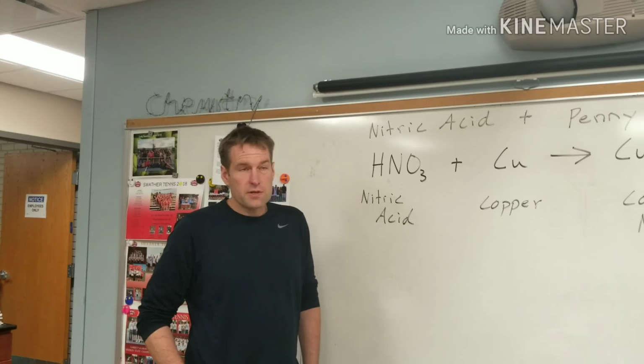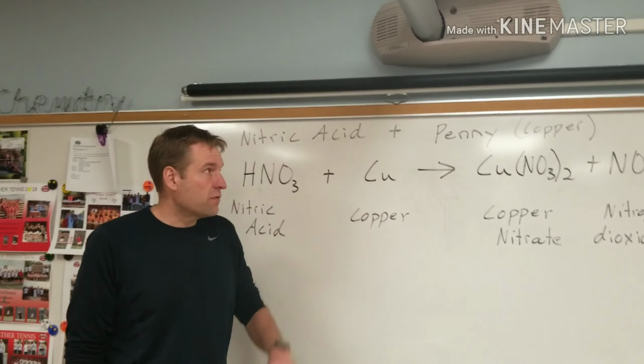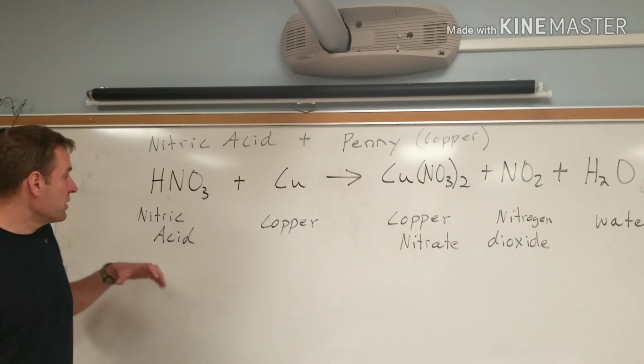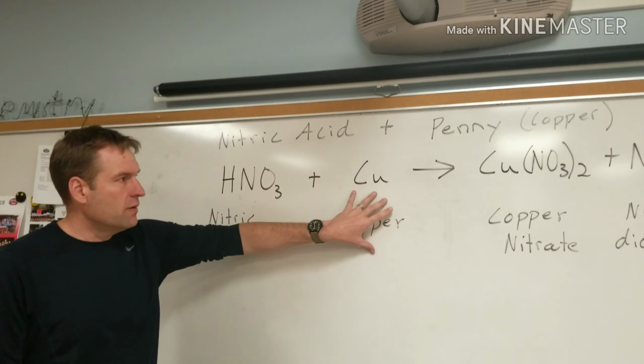Okay, for our second demonstration, this one's going to be nitric acid reacting with a penny. Our penny, of course, is made of copper, at least the outside is going to have copper in it on our new penny. So we're going to take nitric acid, which is HNO3. It's going to be concentrated nitric acid. It's going to react with the copper.